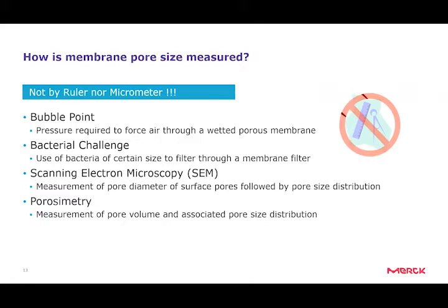There comes a point where there's enough pressure that it allows the air to go from one side of the membrane to the other side of the membrane, creating a steady stream of bubbles. And because of that, this particular test is known as bubble point. Millipore and Merck Life Sciences has been involved in standardization of this test right from the beginning.